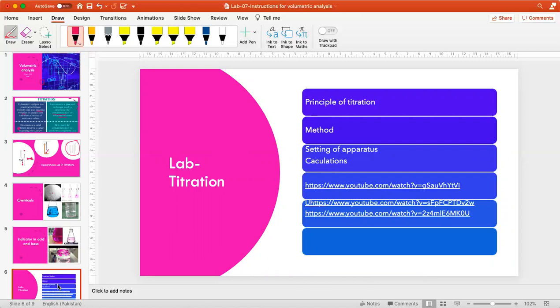So due to the chemical reaction taking place in the sample, which is analyzed, the characteristics of the sample changes. उसकी changes आएंगी उसके अंदर, and the changes will be obvious by the change in the color. The change of the characteristics can be detected by indicator in this case.